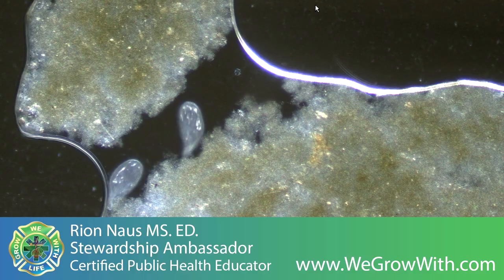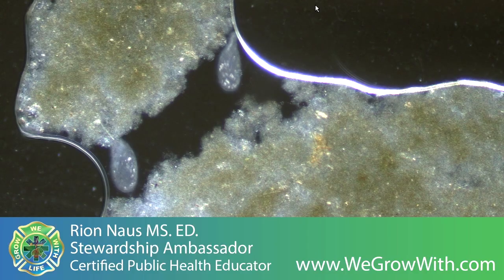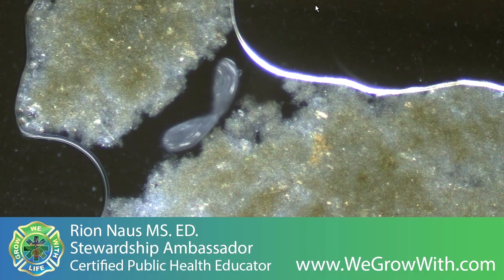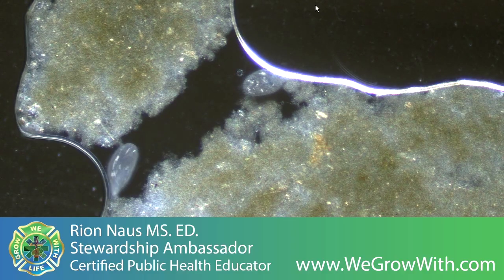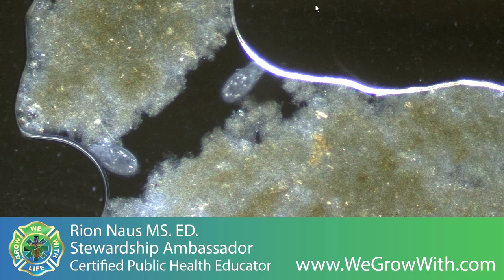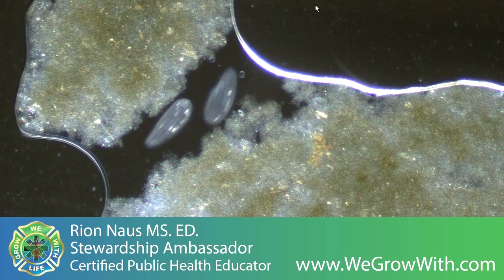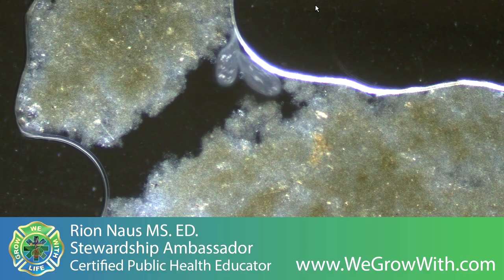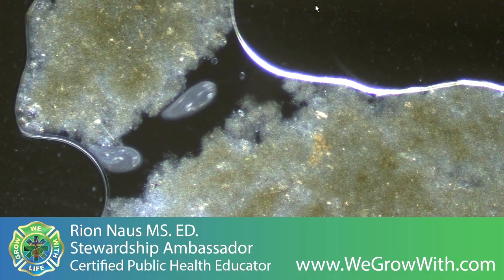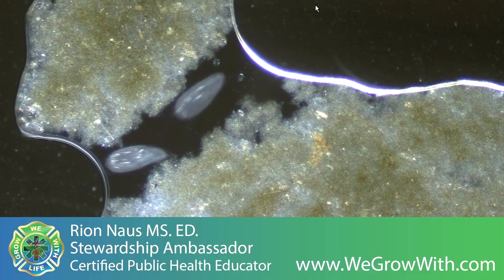So this video demonstrates many different facets and a few different microscope techniques, but really it's an observation tool. You need to be able to see. This is all what's really going on all over the place. When you water the lawn, everything is suspended and hydrated, and as it dries out, everything dries out, just like we're watching. But being able to observe allows us to serve in a much more relevant manner.